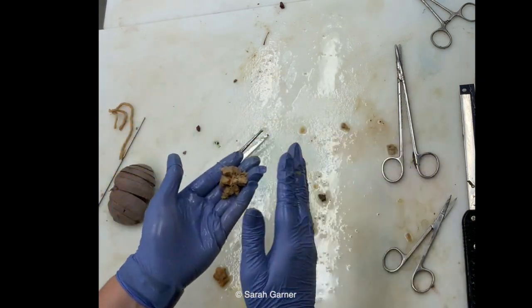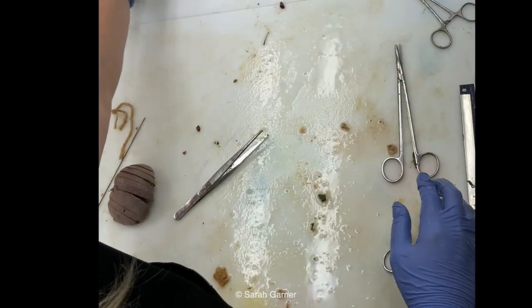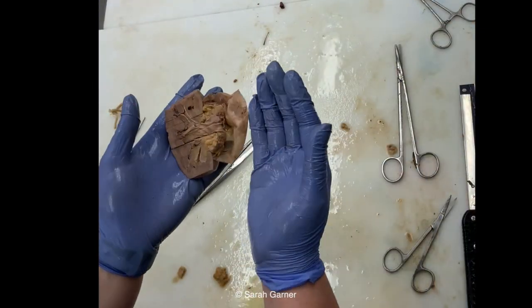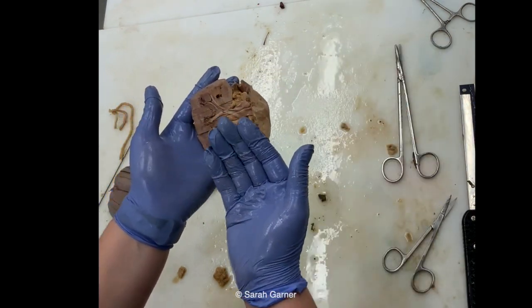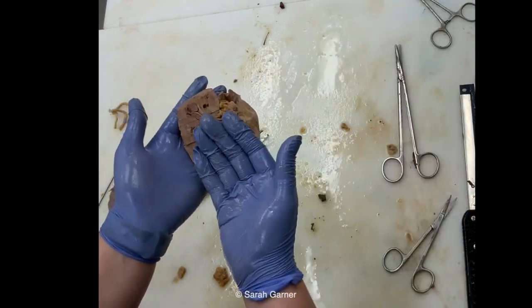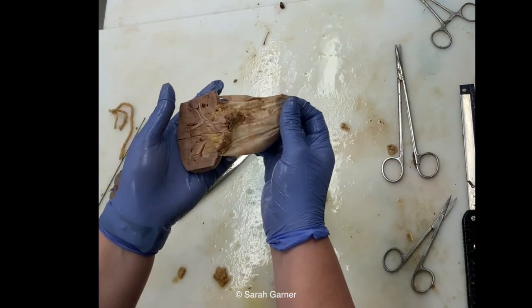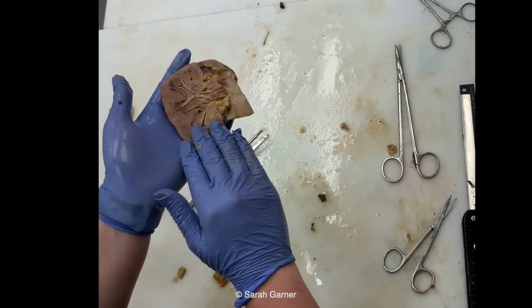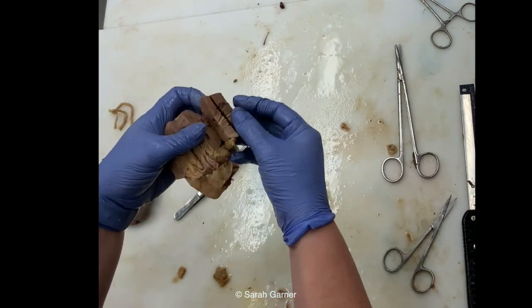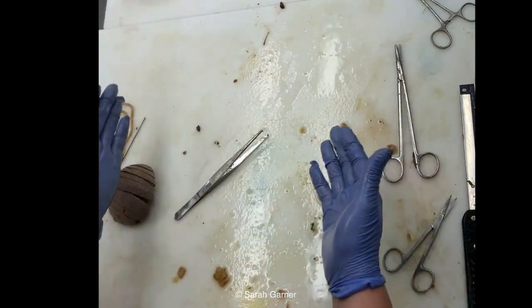So we started with our adrenals, we found those, then we did our kidneys. With our kidneys, we opened up the vessels and the ureter, and we probed through the ureter and into the caliceal system. We bisected along there. We then peeled off our capsule, noted if it was difficult to strip or not, noted the external surface, described and took any measurements you need of the internal, and then you serially section it to make sure you're thoroughly examining. You do that with both kidneys.